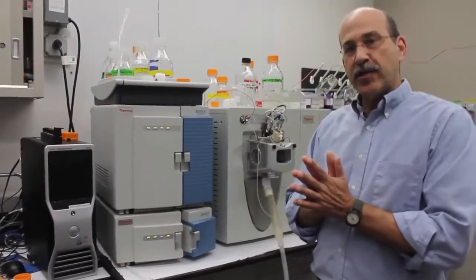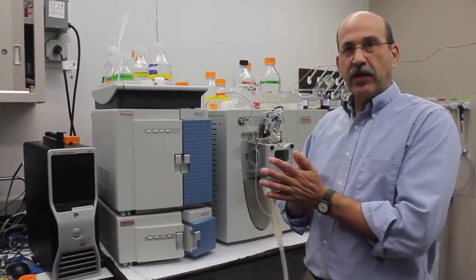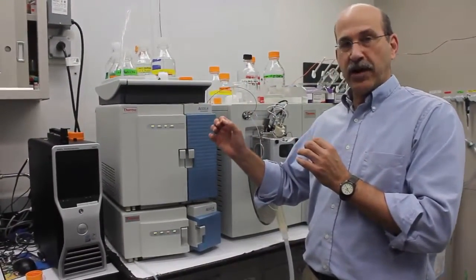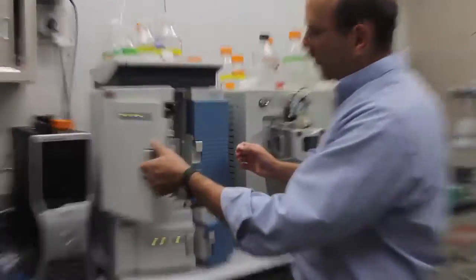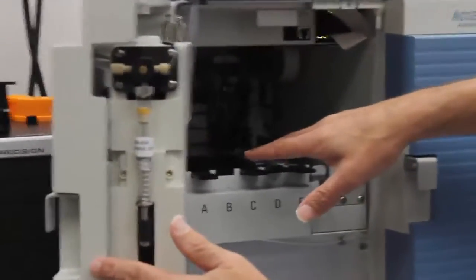So liquid chromatography separates those non-volatile and polar species using a chromatographic column, and instead of separation based on boiling point, the separation occurs based on its affinity for the solid phase material in the column. So we start with a number of samples here. We might have an entire rack. You see many, many samples there being analyzed.